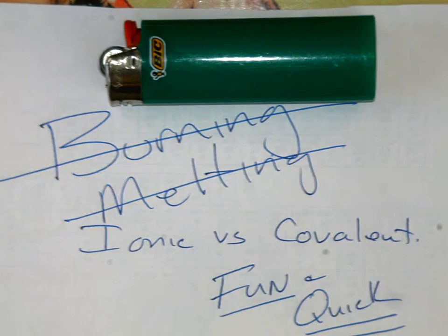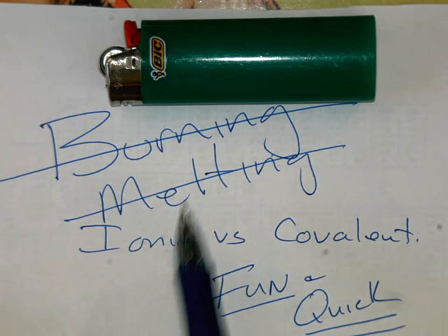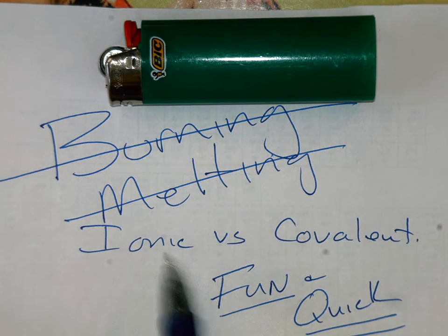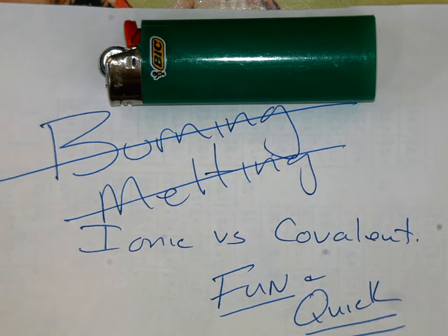Hey everybody, this is Mr. Kenny. This is just a quick little add-on we didn't get a chance to do in the lab. I'm gonna burn/melt ionic versus covalent compounds real quick just so you can see it.